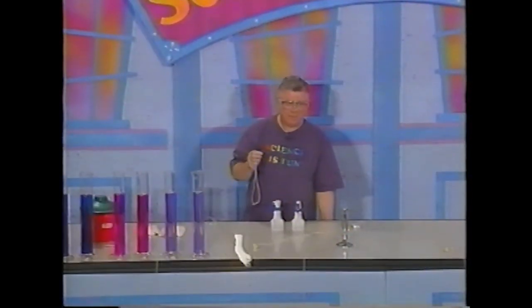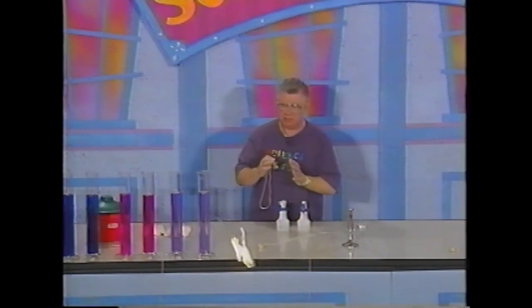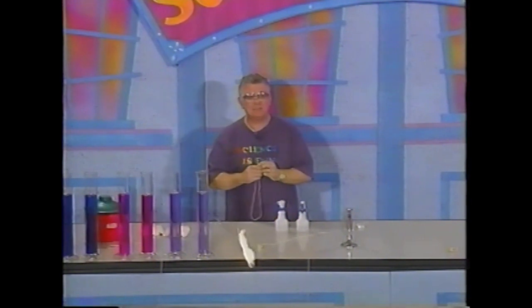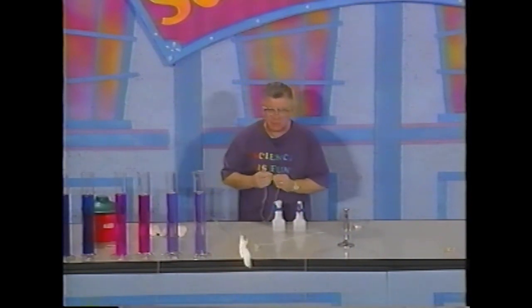That balloon, I know it's all very exciting, but let me tell you, that balloon had in it a mixture of hydrogen and oxygen. There was a lot more oxygen available for the hydrogen to combine with. And so next what we should do is what we always do in science.